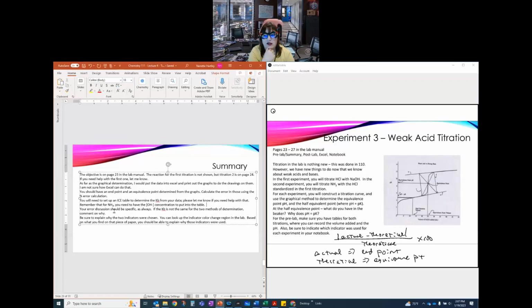Other things that typically are problematic, or that we're not as careful using the burette as we might need to be. So instead of getting a very small amount added, we added a little more than we should have. That does happen. There is a very unique way that titrations have to be done physically to make them work, and it's an experience to learn how to do them appropriately. So that's something that you guys are missing, and it's kind of sad.